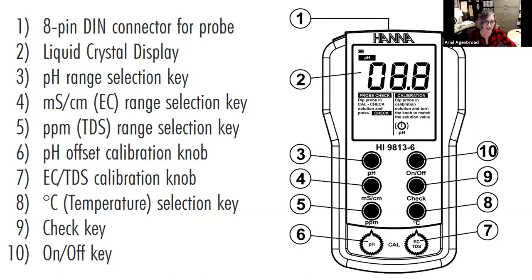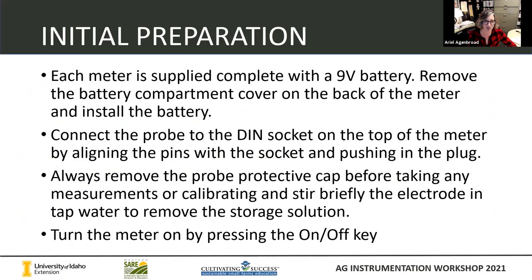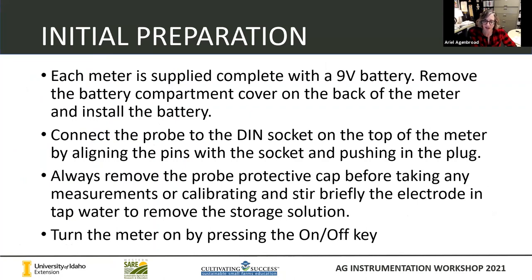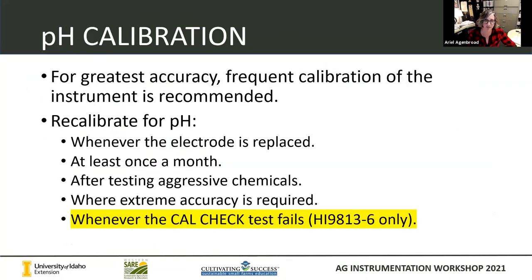Each of your meters is going to come with a nine-volt battery. Go ahead and install that and start using it. Connect the probe and really you're ready to get going. If it has never been used before, or it's been sitting for a while, or you've been keeping it in storage solution, you'll want to rinse that off in water and get it ready to go, and then turn it on.